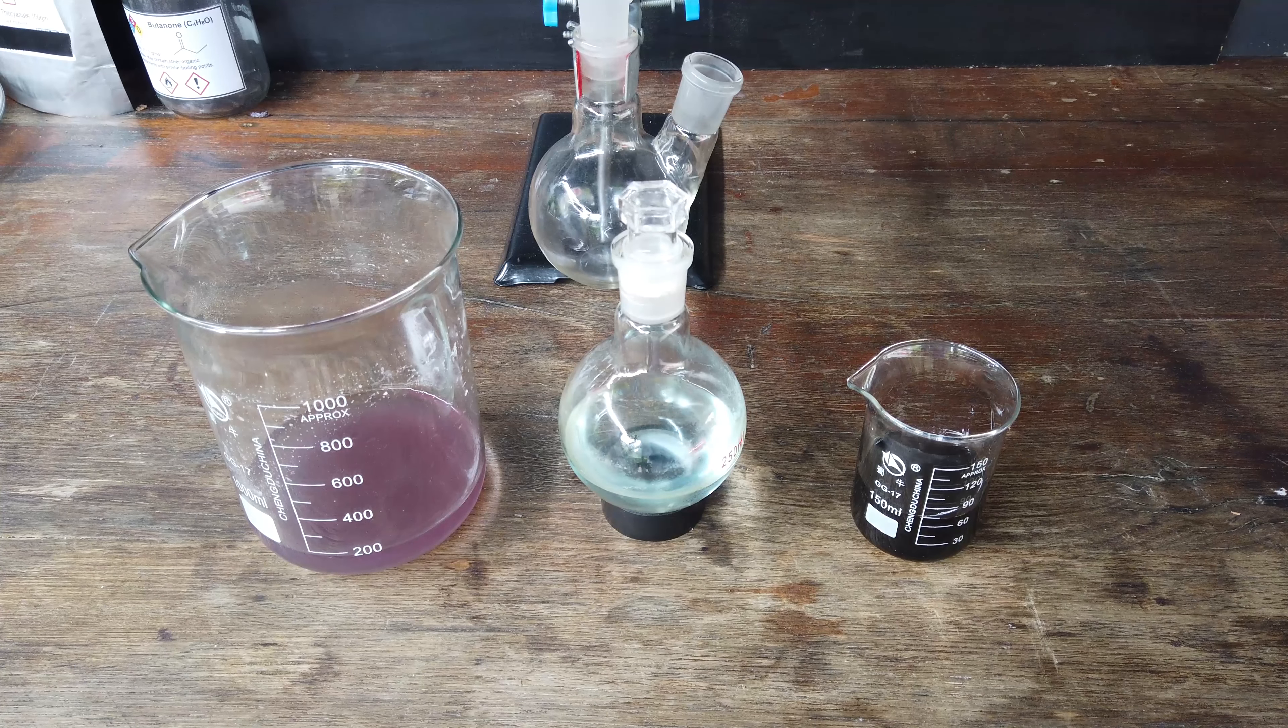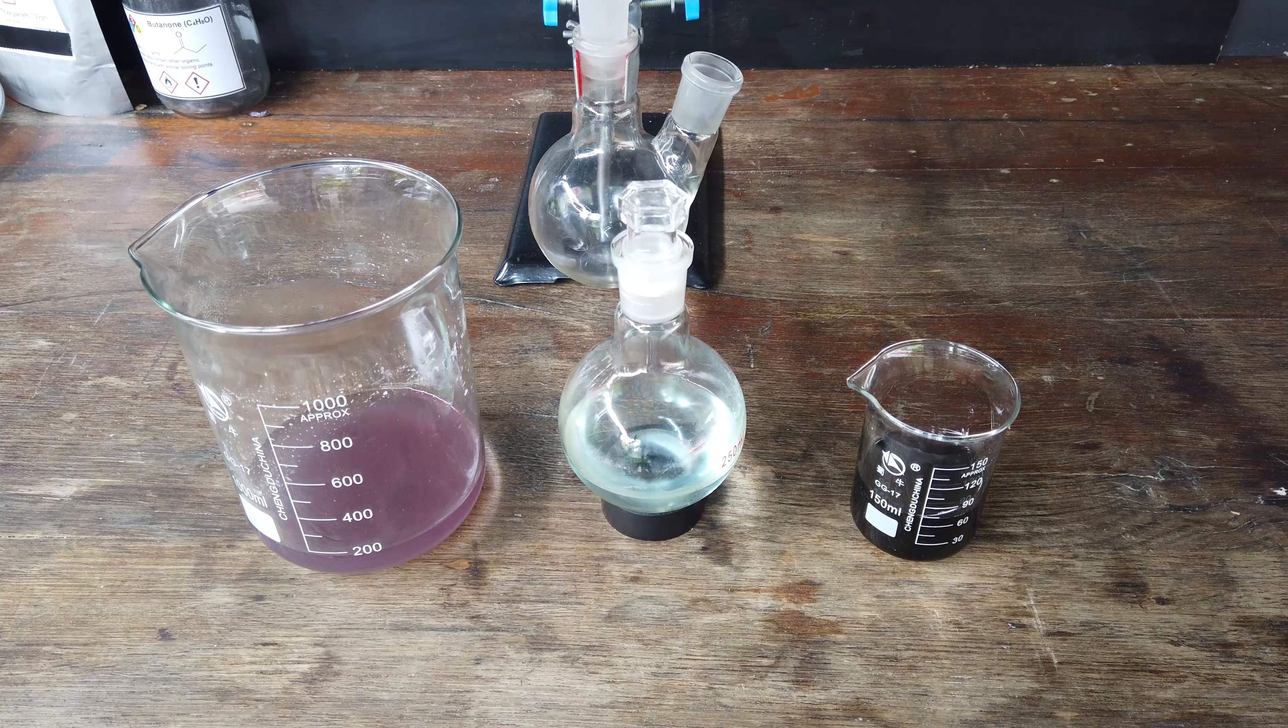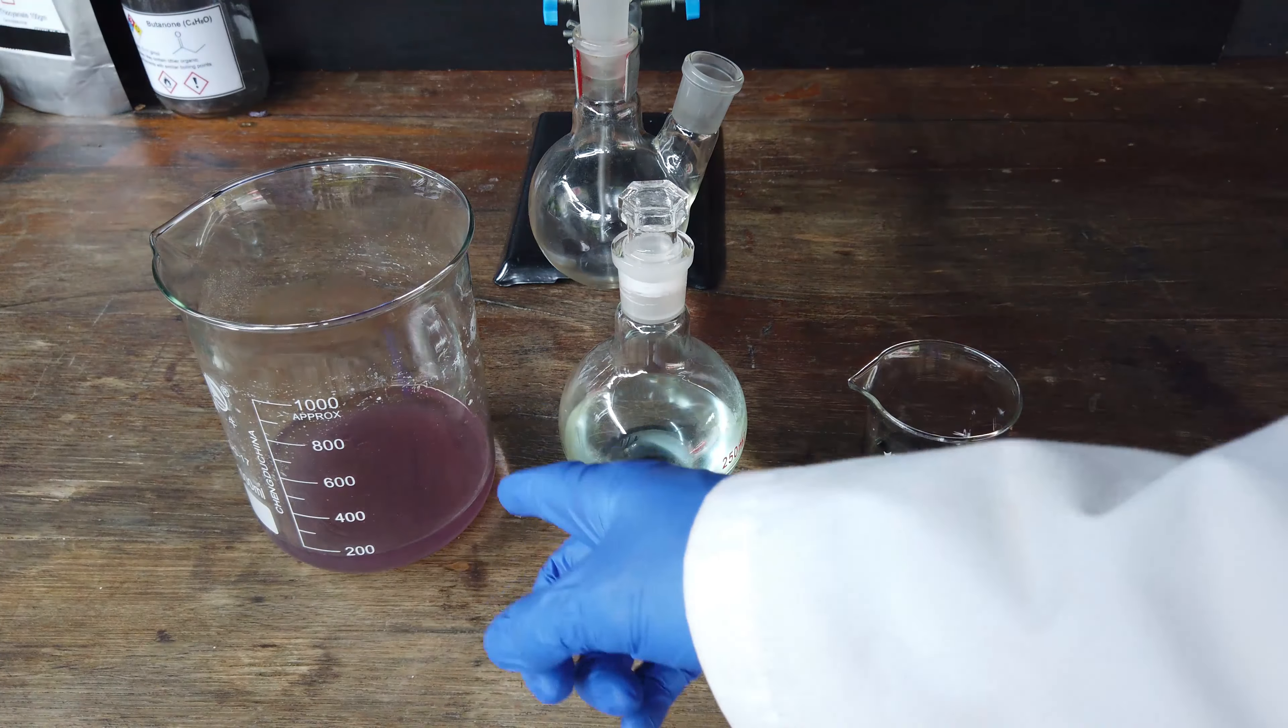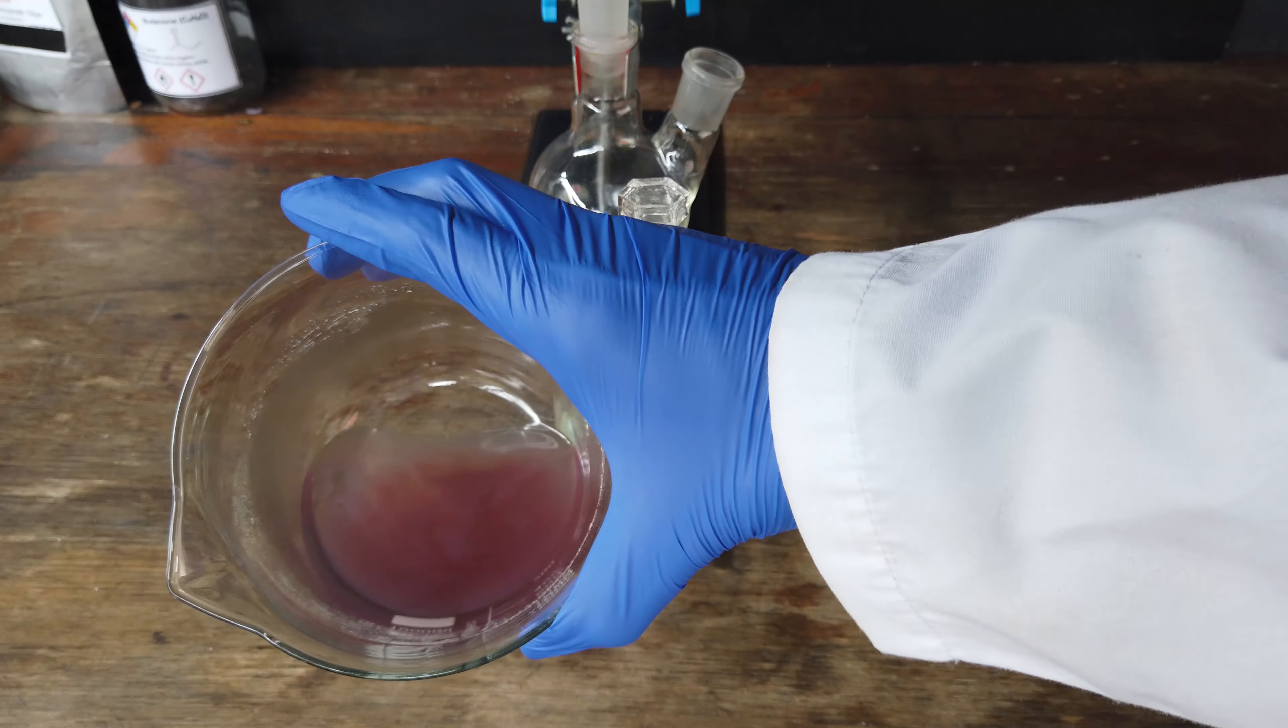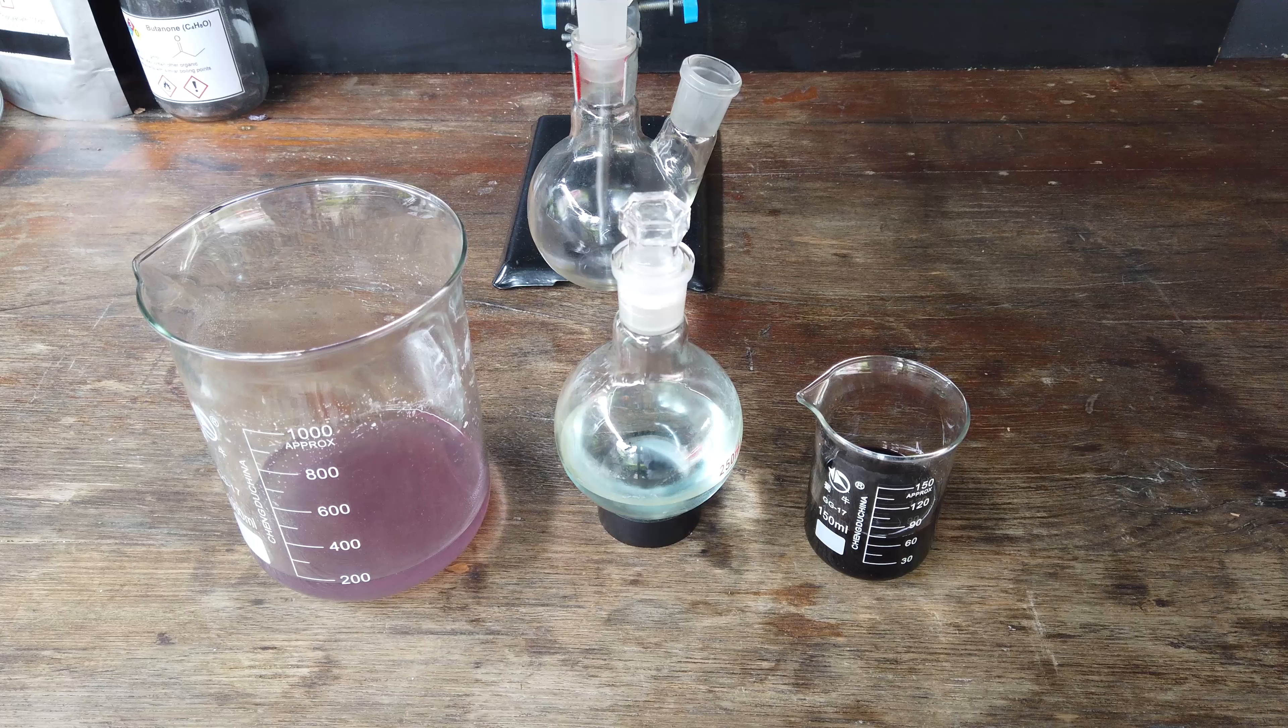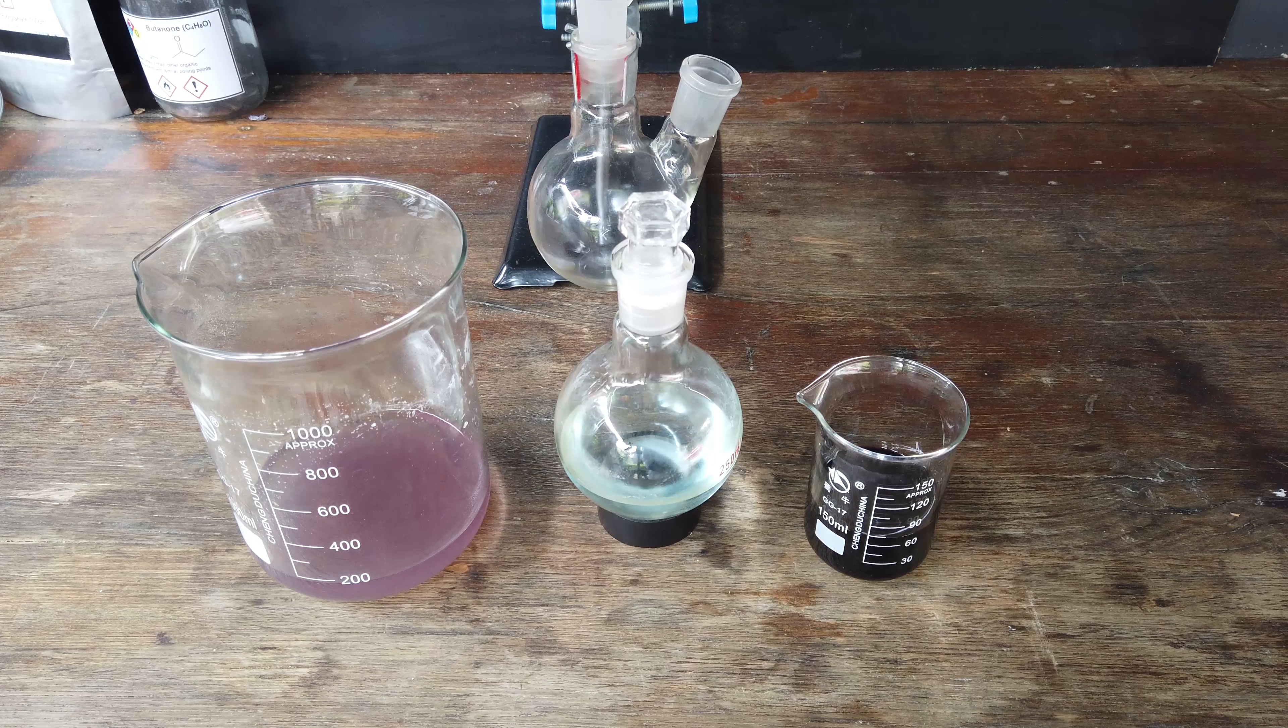With trial and error, I've found that we can extract the cobalt from the butanone layer by dumping the butanone into a solution of sodium carbonate. When we do that, the cobalt precipitates as cobalt carbonate—you can see that as the pinkish precipitate—and the butanone loses most of its color and is ready for another extraction. With that worked out, I think we're ready to do the full extraction on all the cobalt from our original dissolved metals.